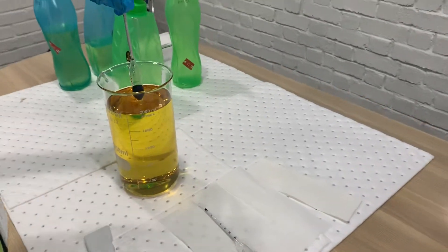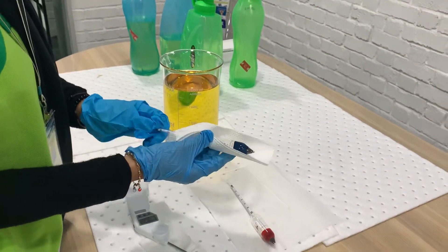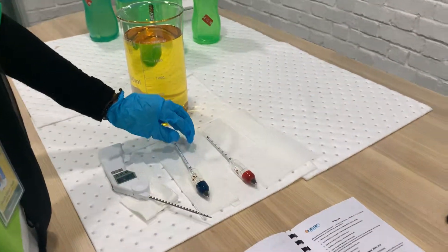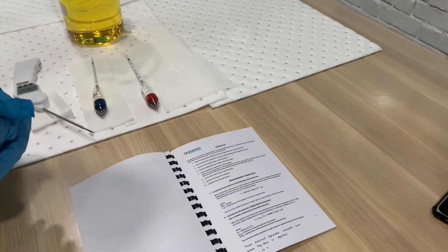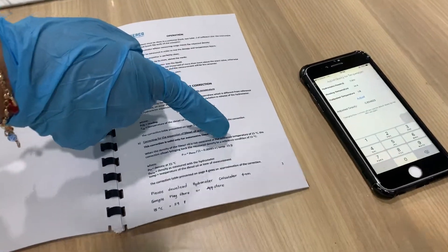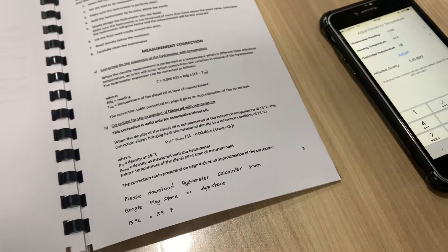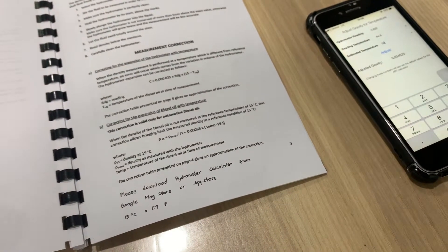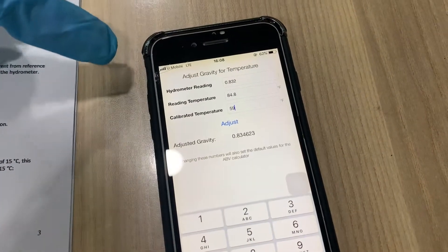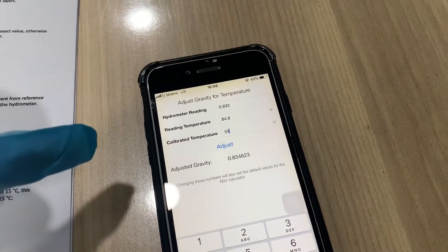Now we take out the hydrometer and wipe it. Next, we want to calculate the density. Use this formula. You can download the hydrometer calculator from the Google Play Store and App Store. Insert the data you get and click adjust, and you get the answer.